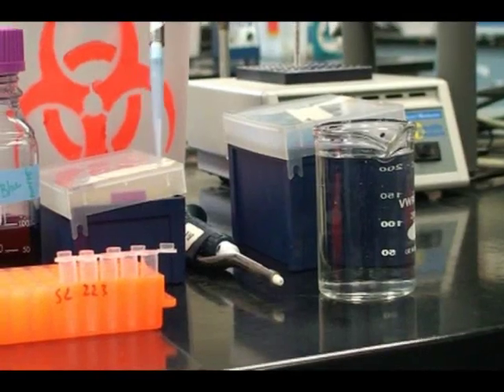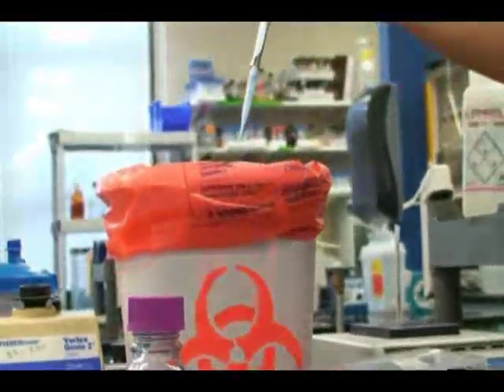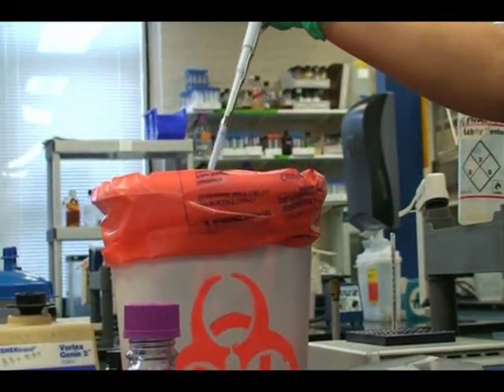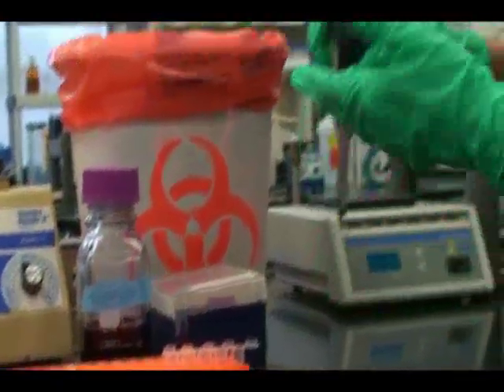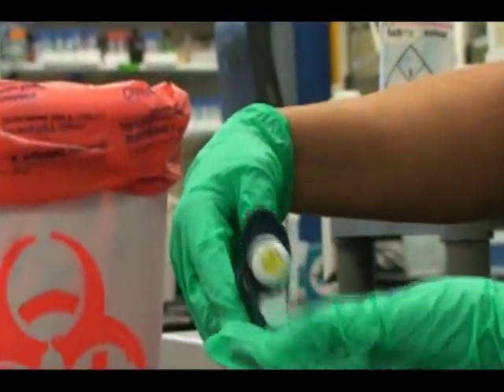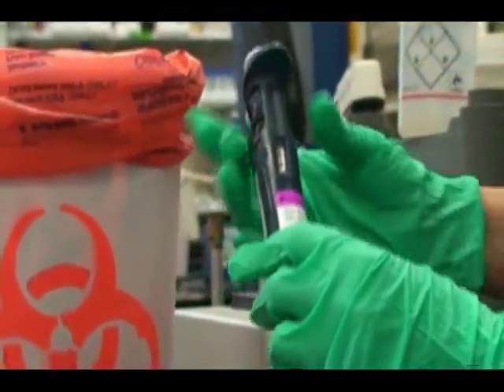After filling all the tubes with 900 microliters of dilutant, throw the pipette tip into the white semi-sharps biohazard bin on the lab bench. Next, take a 200 microliter pipette man and set it to 100 microliters.